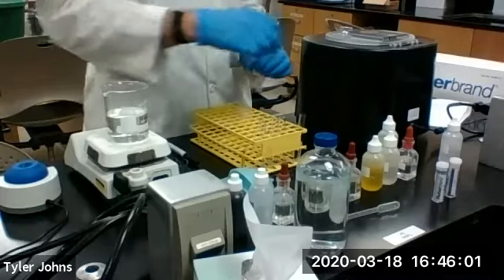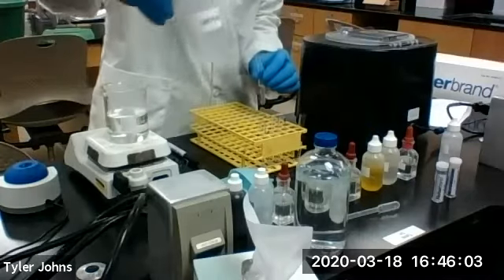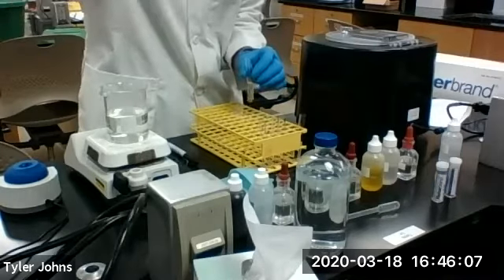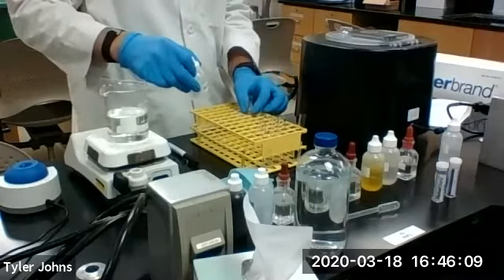we're going to add 3 molar ammonium carbonate dropwise until it is just basic.